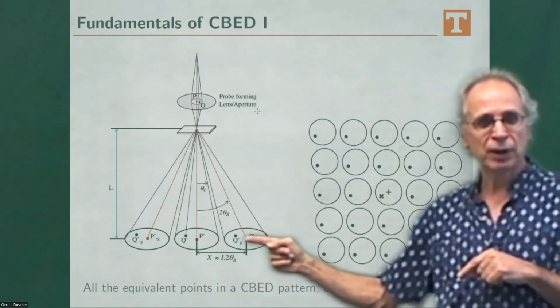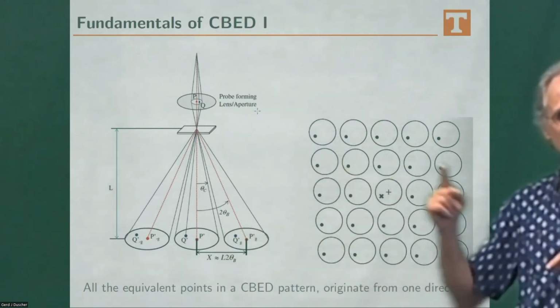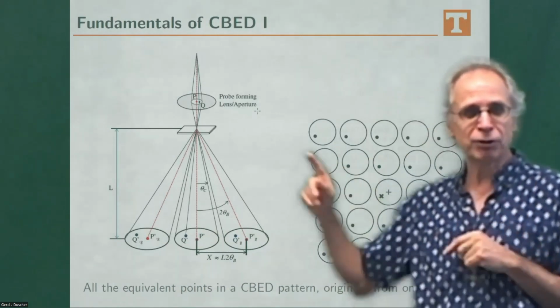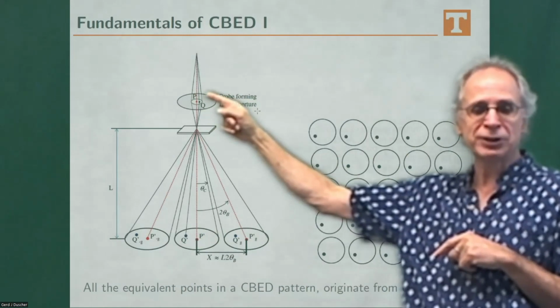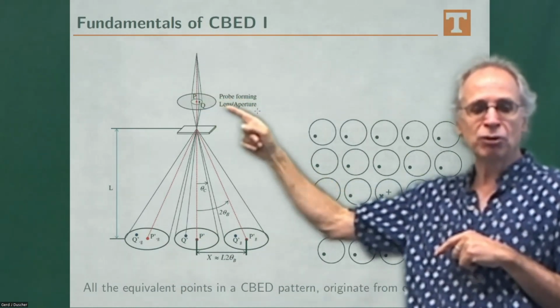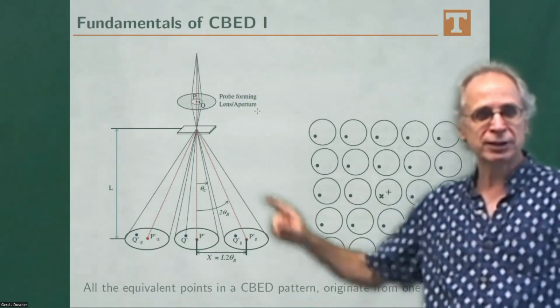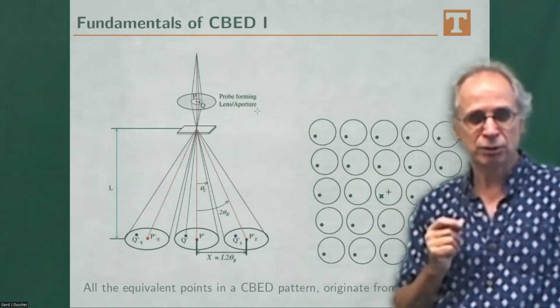If we come in with a different angle, then this different angle also will make a spot pattern. But if you tilt the beam, so now we have several tilts up before the sample, that is your convergent beam. Doing that is equivalent to tilting the sample. If you tilt the sample or tilt the beam, what you get is different excitation errors.